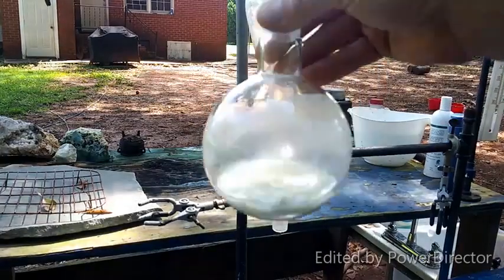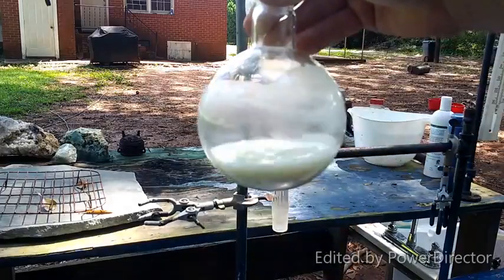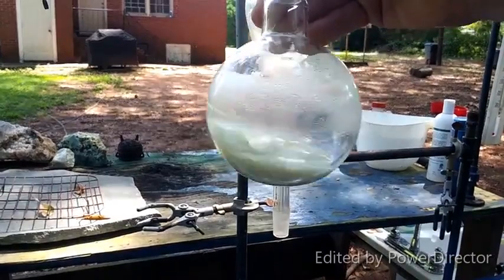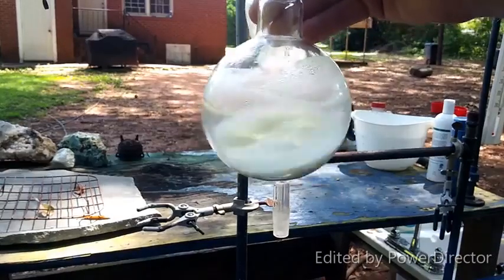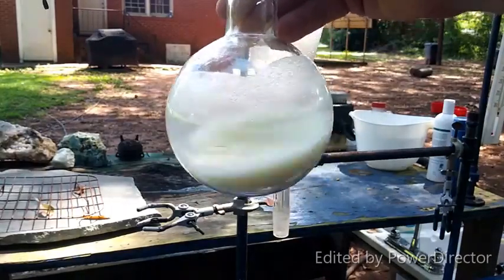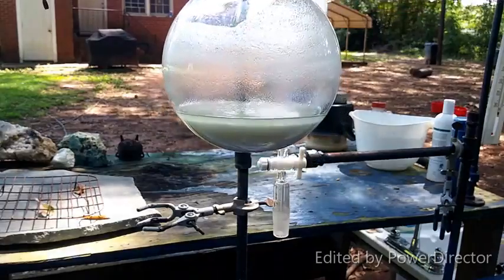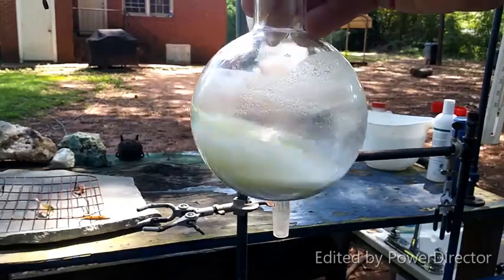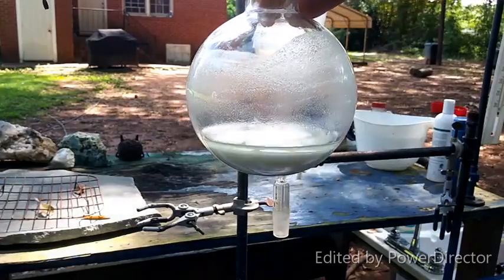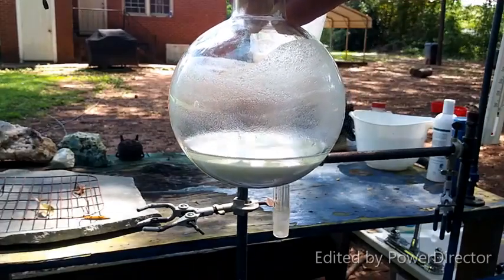Excellent. Well, you can see how wet it was. A lot of that stuff clumped right up. But, as you can see, if I hold it up high enough, it's not all clumped. We do have some loose, still powdery magnesium sulfate suspended in the ether. So that means that we have added enough. It is dry, and I'm just going to let it sit over this for a little bit, and then I will filter it out, evaporate off the ether, and we will have our pure diiodomethane.